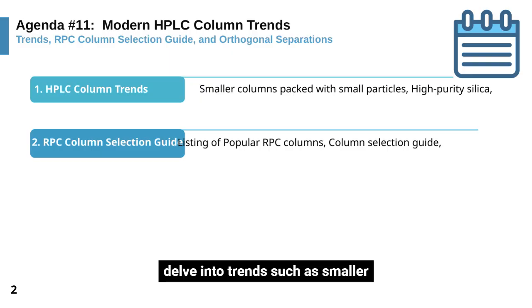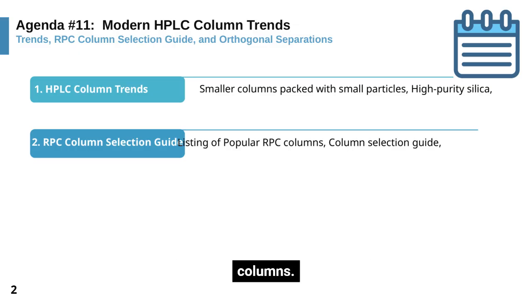We'll delve into trends such as smaller columns packed with small particles and the use of high-purity silica. Additionally, we'll explore a selection guide for popular RPC columns.